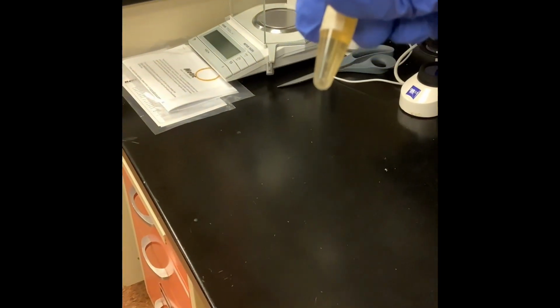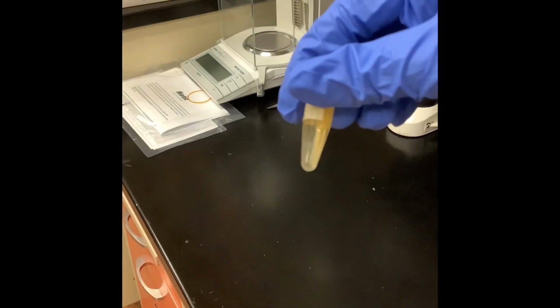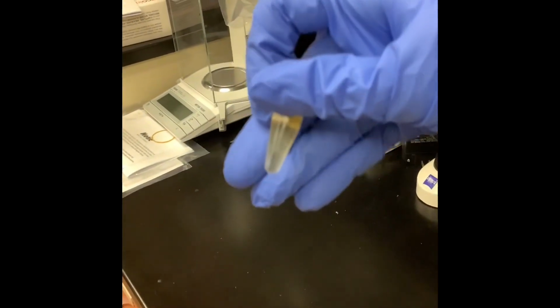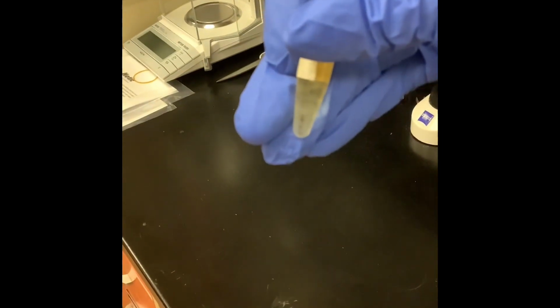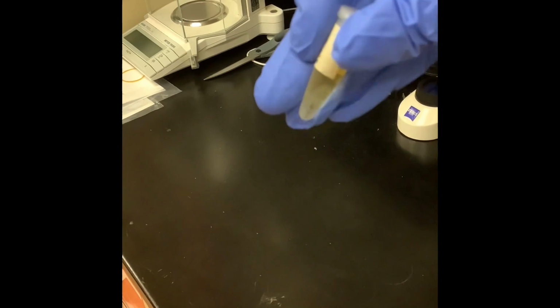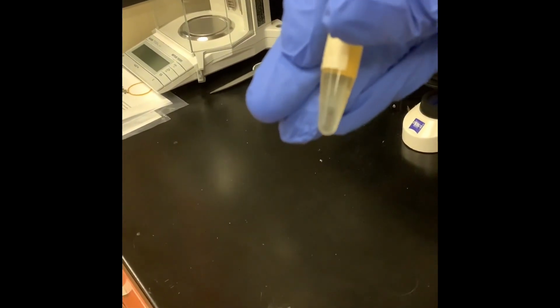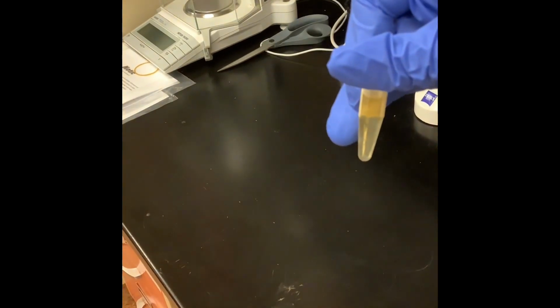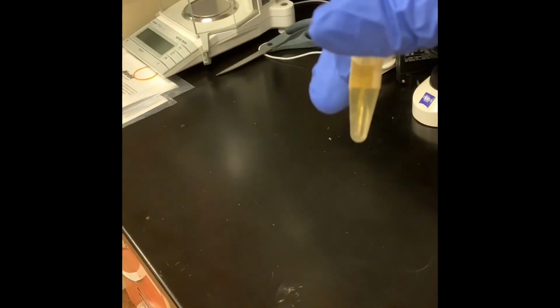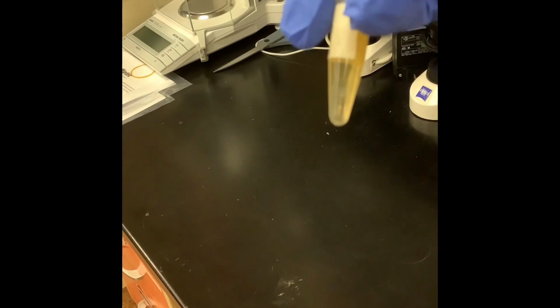So after the centrifuge step, you might be able to visualize the pollen. It'll look like little black dots. You can kind of see it at the bottom of the tube there. It'll probably be all collected on one side of the tube. So that's your pollen sample. And the next thing you're going to do is use a pipette to remove as much liquid as possible without disturbing those pollen grains.